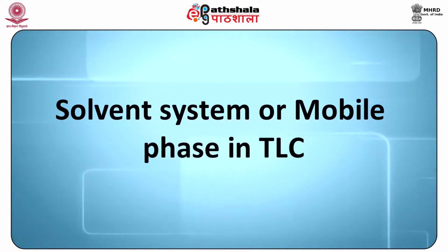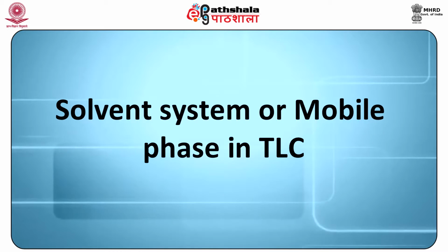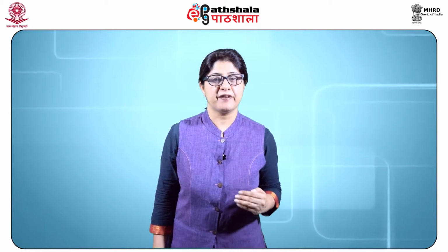Solvent system or mobile phase in TLC. The mobile phase is a liquid in thin layer chromatography. The mobile phase is usually a combination of 2 to 5 different solvents selected empirically using the trial and error method, guided by prior personal experience and literature reports of similar separations.